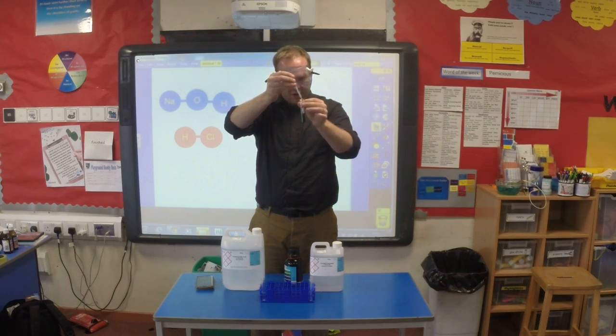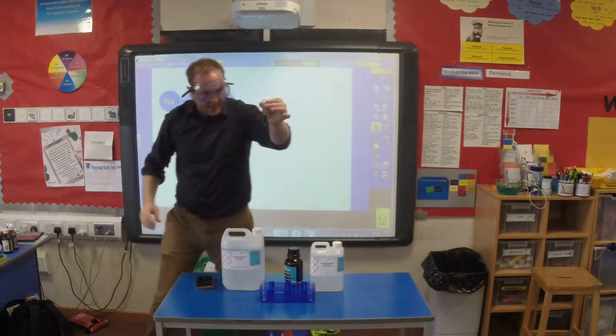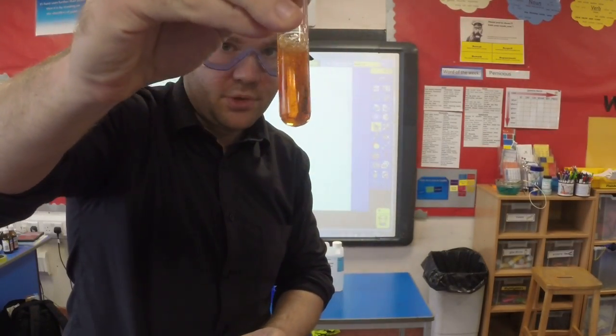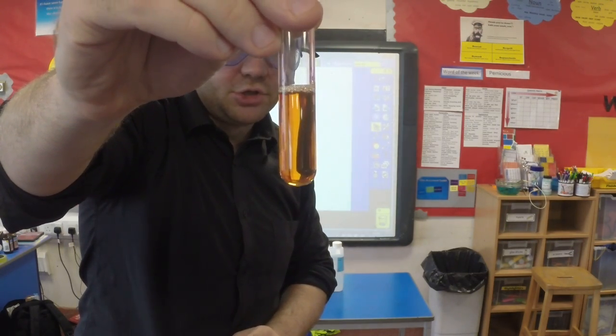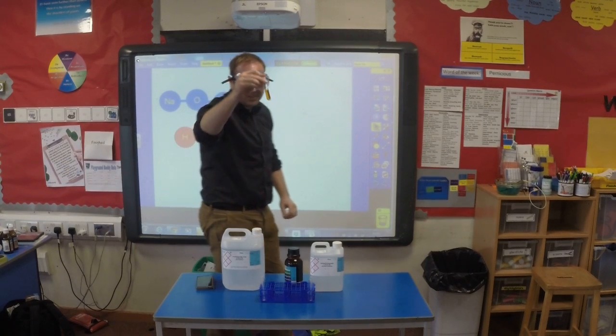So just one drop into the test tube, and we can see it's still green at the moment, but if I give it a little shake, you can see the colour changes quite quickly and quite dramatically. So that has gone to acidic, about pH 5, pH 6, something like that.